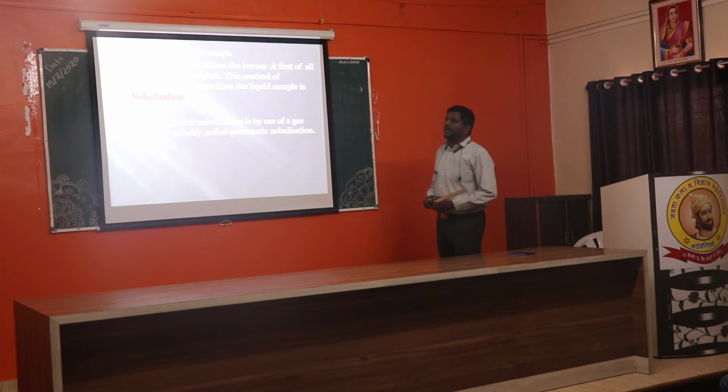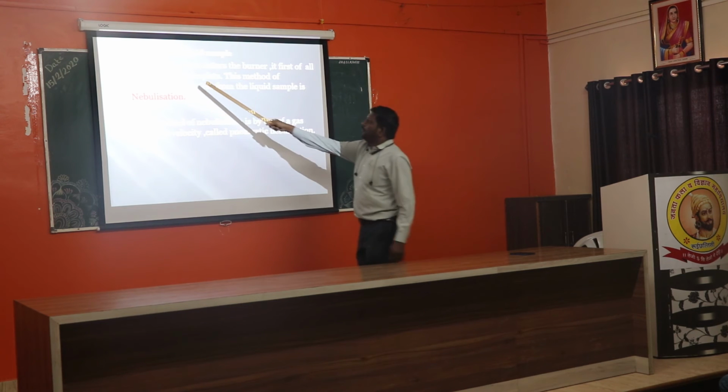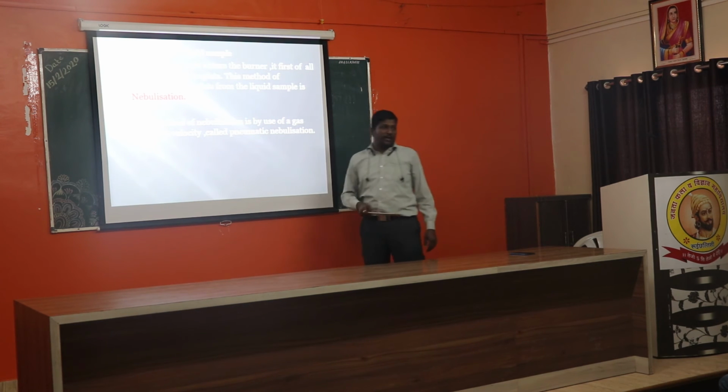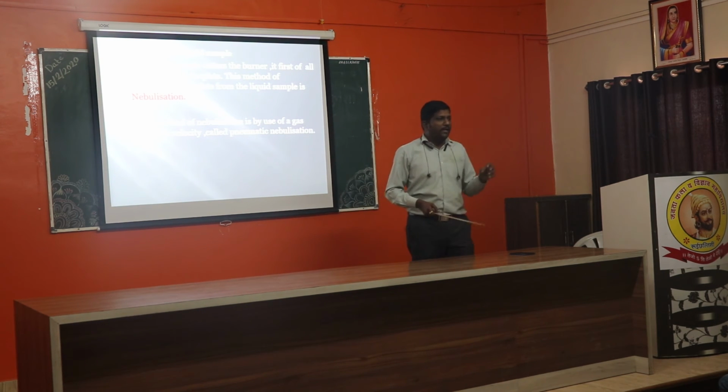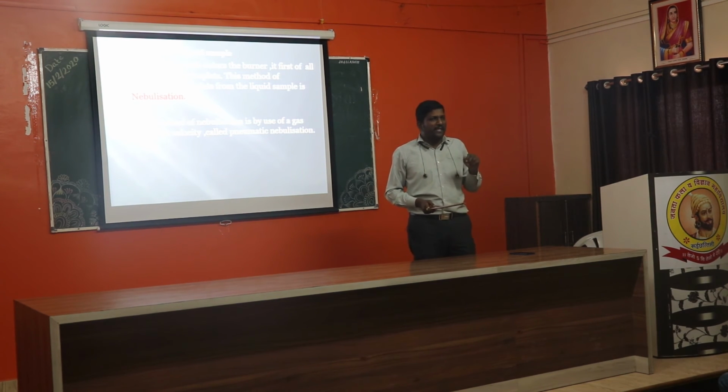Next, nebulization of the liquid sample. Before the liquid sample enters into the burner, it first converts into small droplets, and this formation of small droplets from a liquid sample is called nebulization. This question may be asked in the exam for 1 mark: what is nebulization?